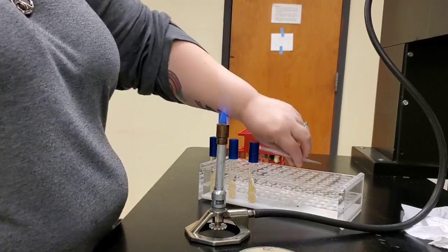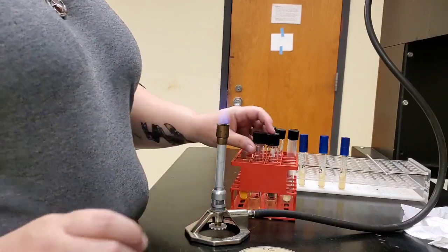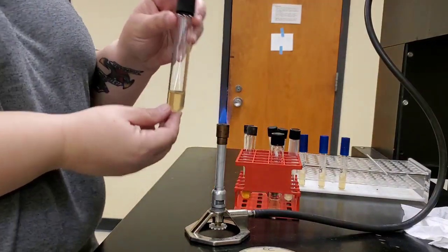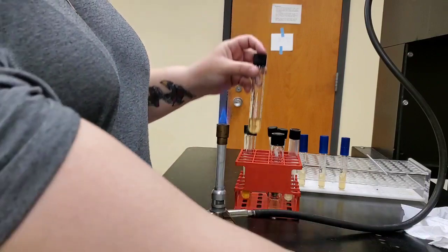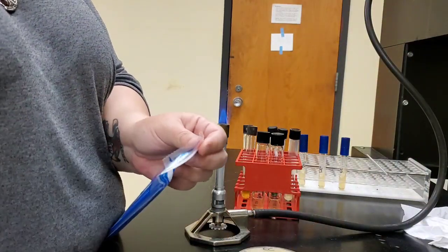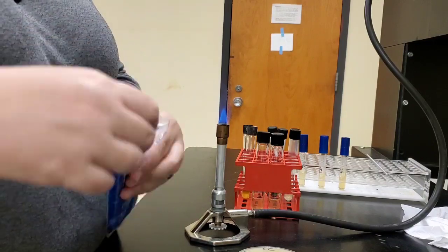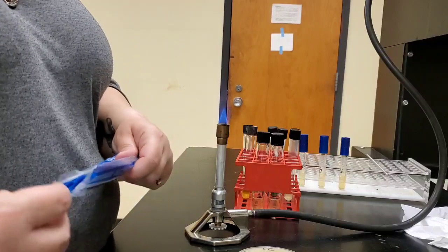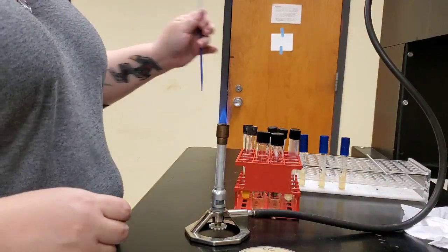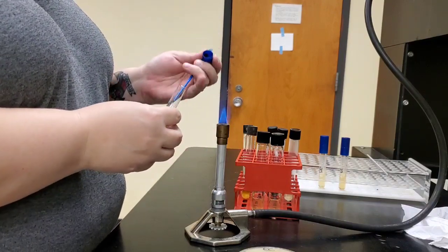Now for our nutrient gelatin. Because this is a solid medium, we use a plastic applicator stick to stab the medium with the organism so that the organism gets down into the medium and can grow. So for this one, we're using Bacillus subtilis.